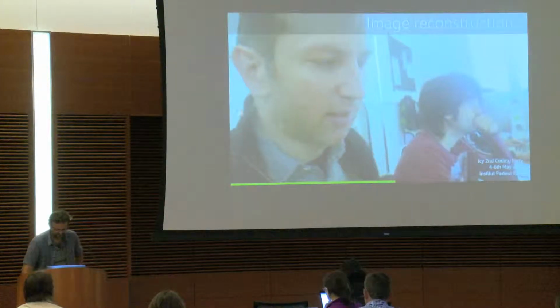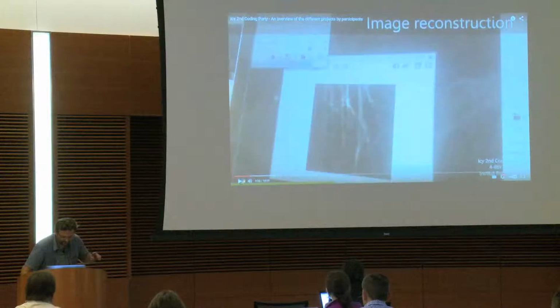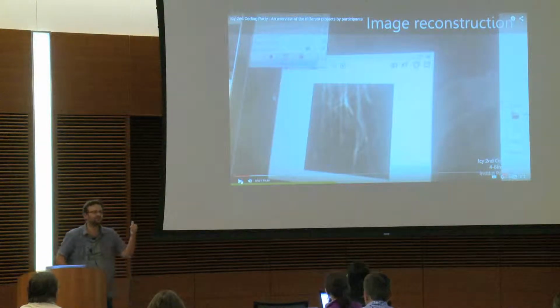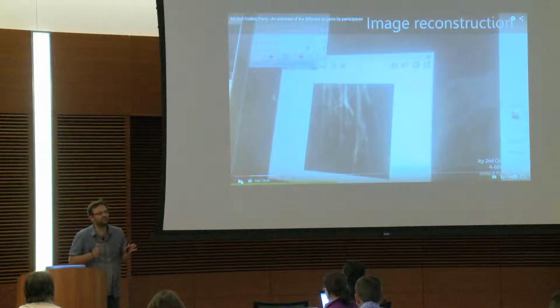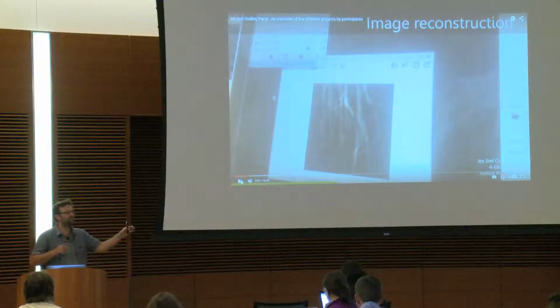So now I can easily put my code into Icy. I'm sorry, but I need to explain something in this. You see this interface, this GUI that is here. It's not the guy that designed this, because it's a pain to design. So we just set a number of inputs and outputs, and we create it for him. And then if he launches it on a cluster, it's the same story as what you had before. We're going to send the arguments to the plugin.